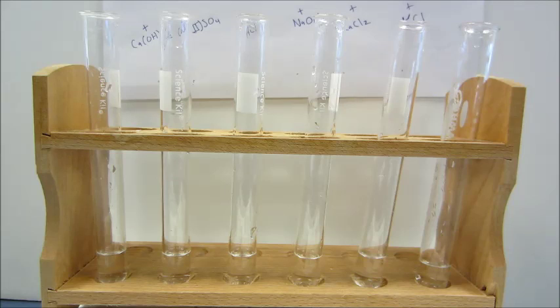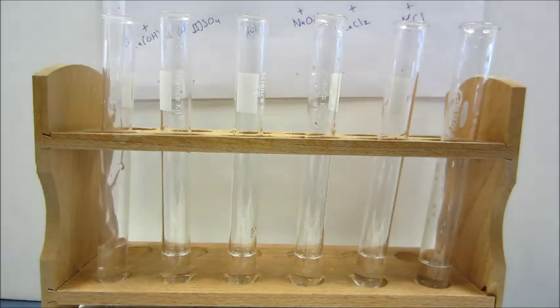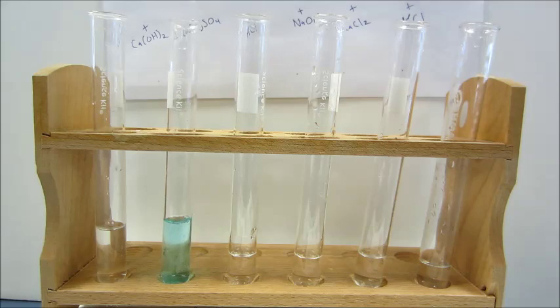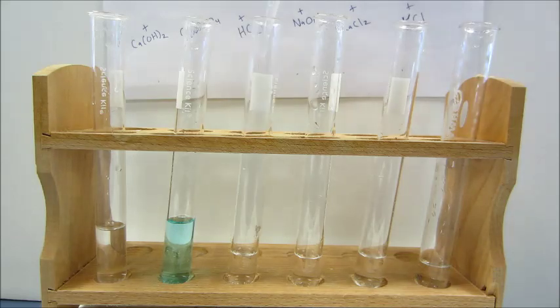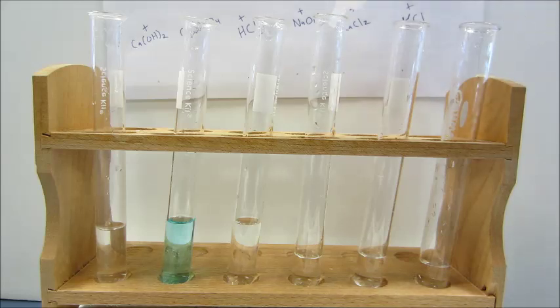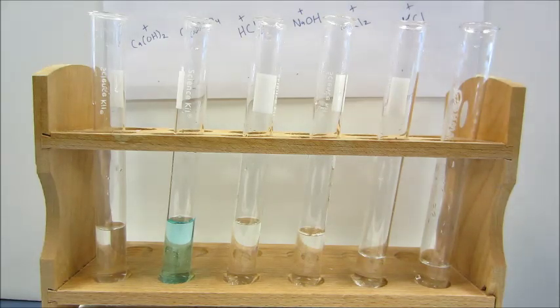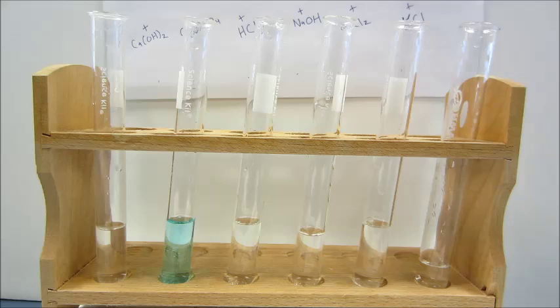We'll start with our calcium hydroxide — this is barely soluble in water, and most of it is settled to the bottom of the beaker. We'll sprinkle some in. Next we'll do our copper sulfate, then our hydrochloric acid, our sodium hydroxide, calcium chloride, and potassium chloride.